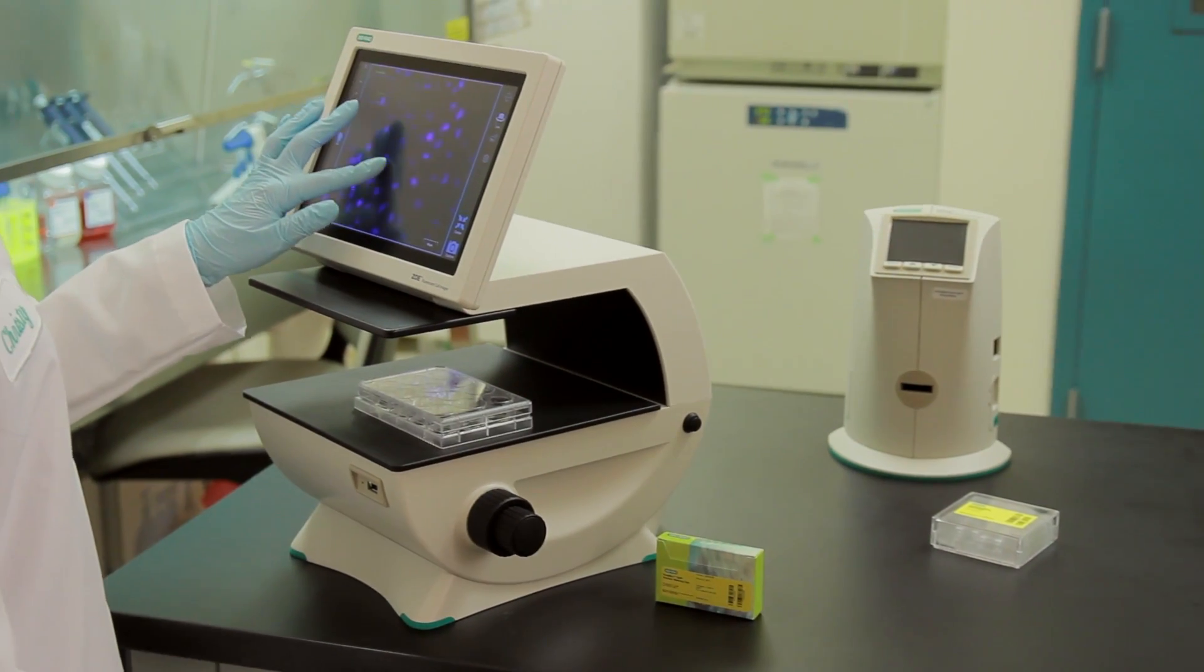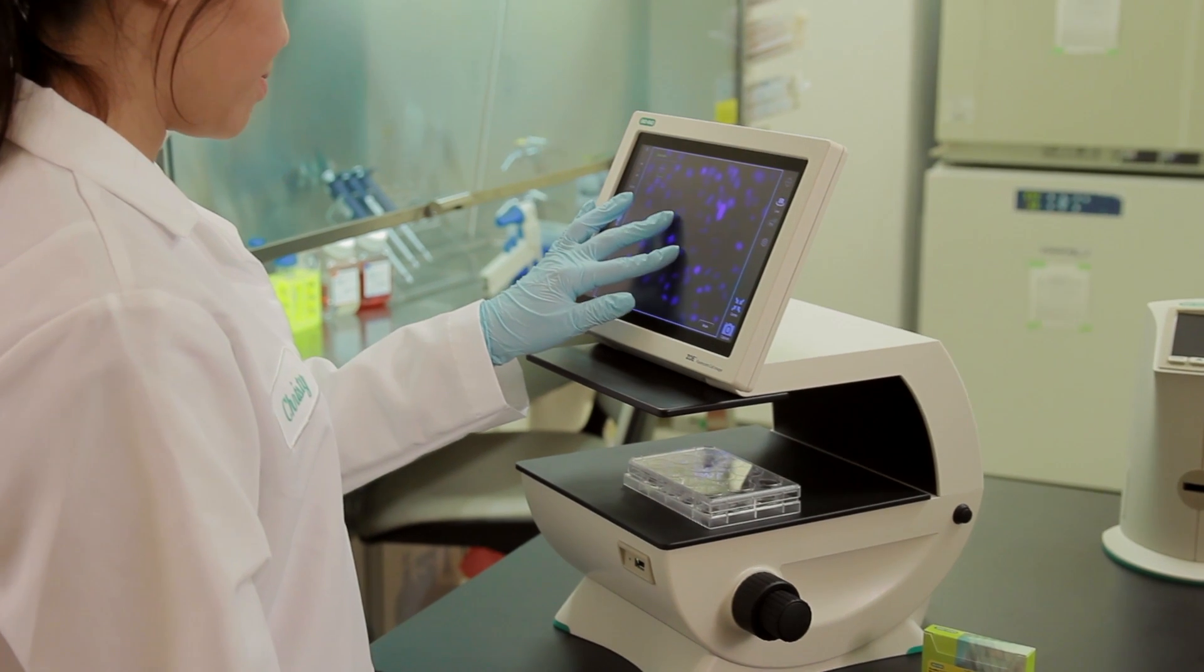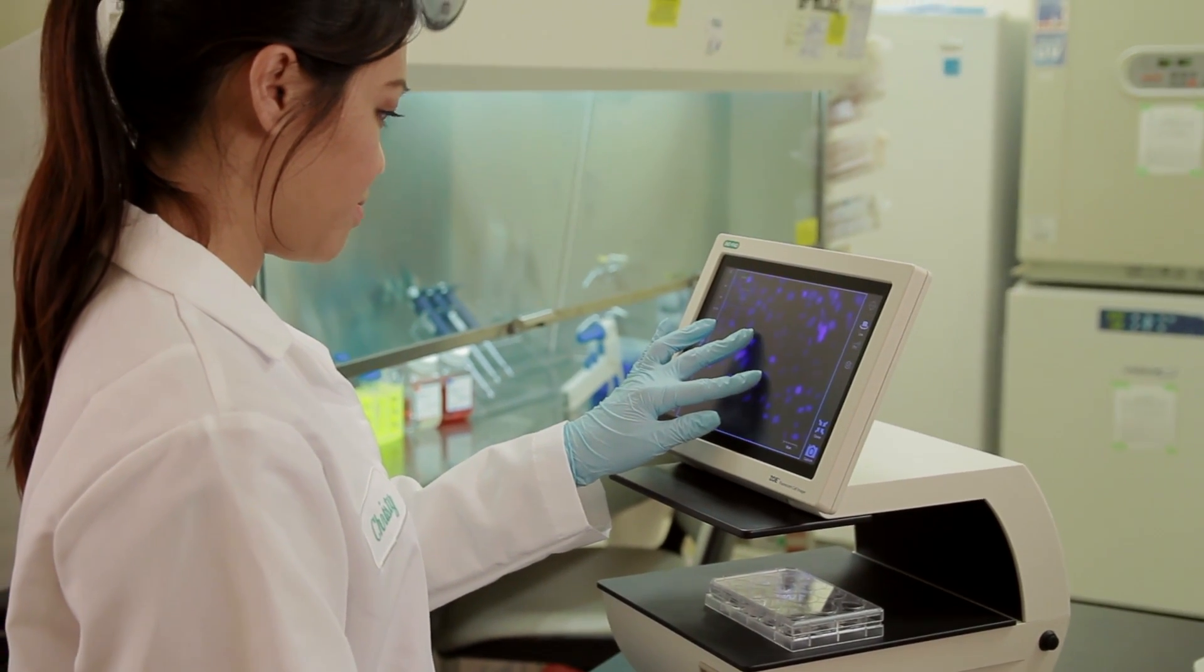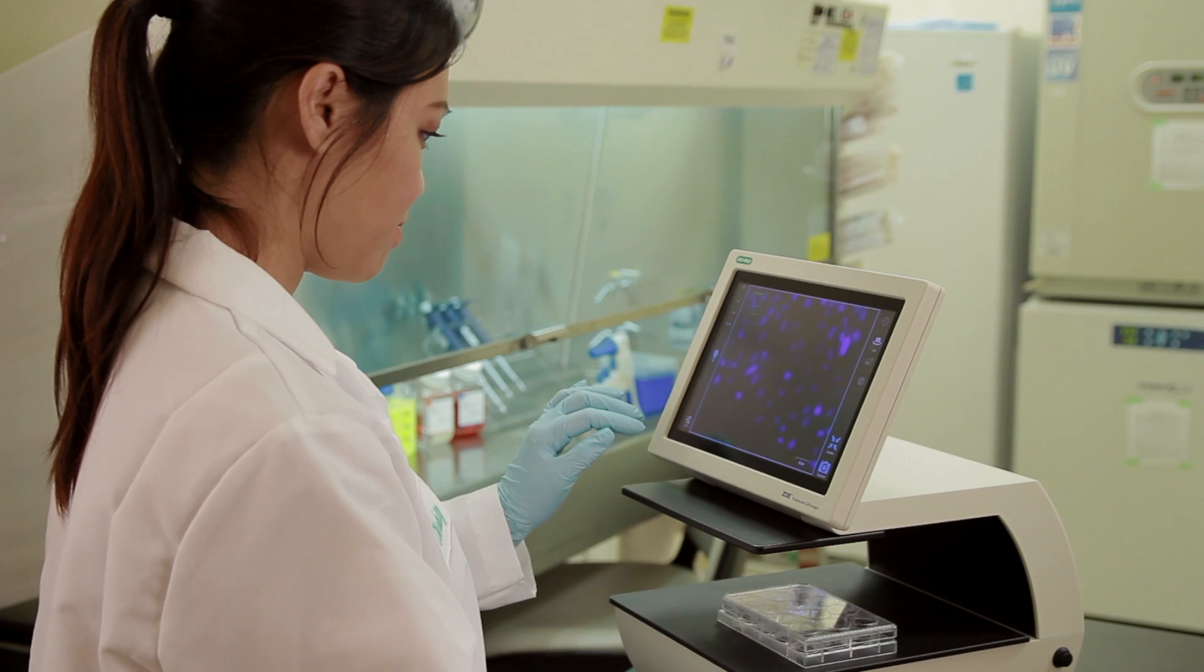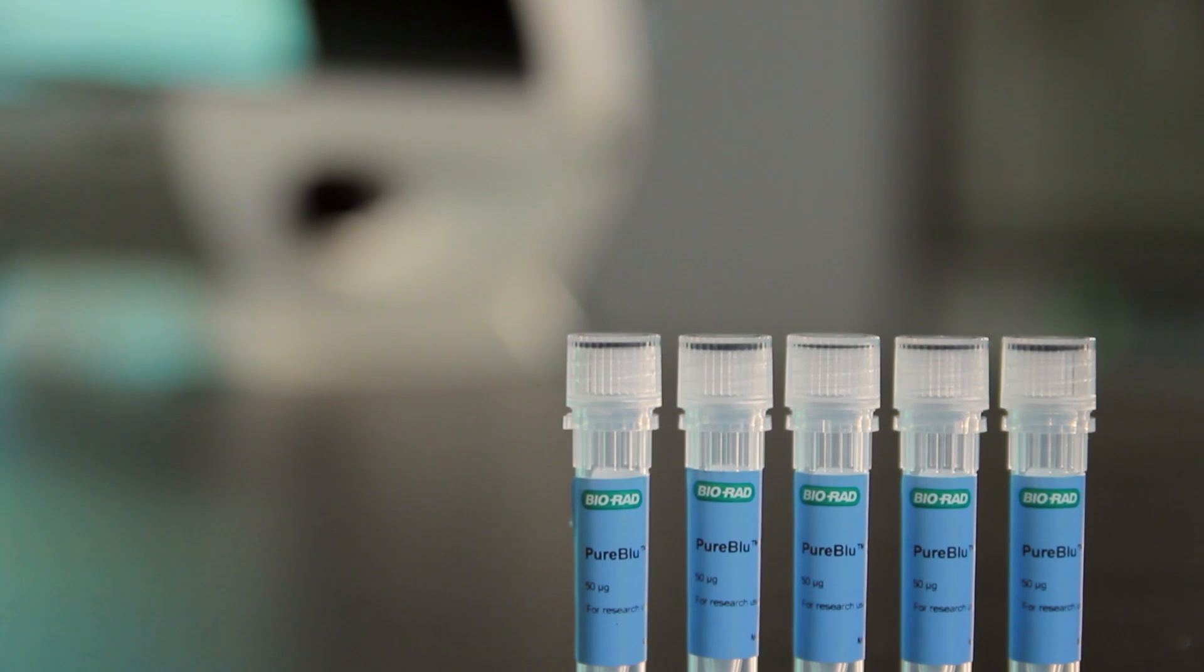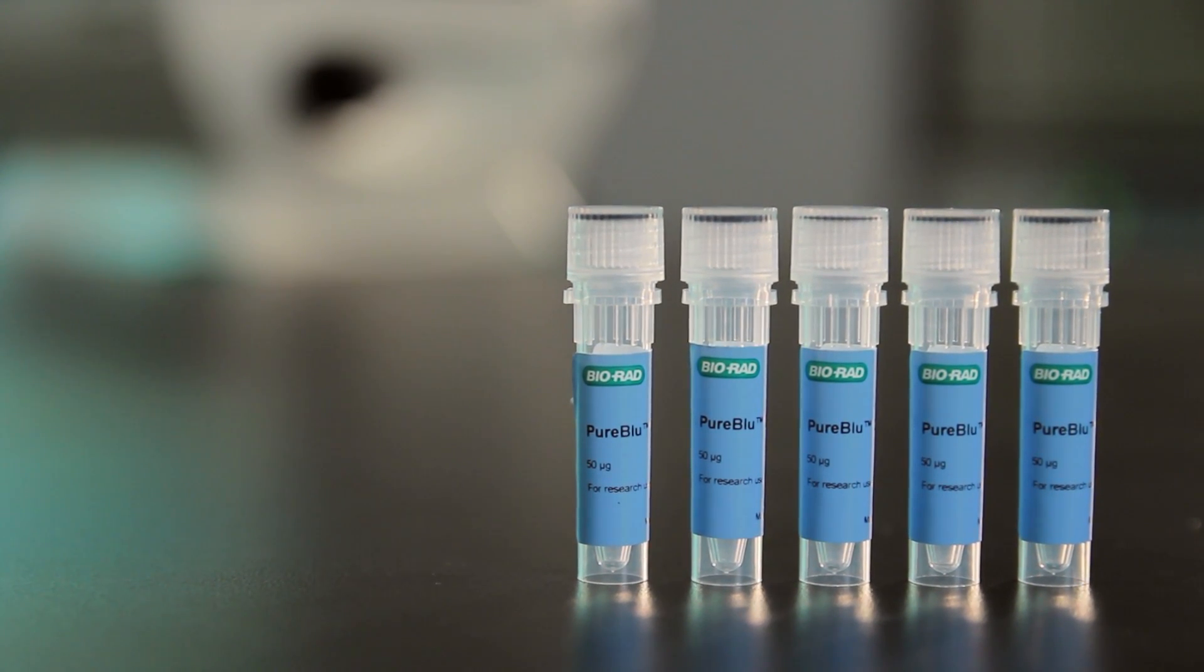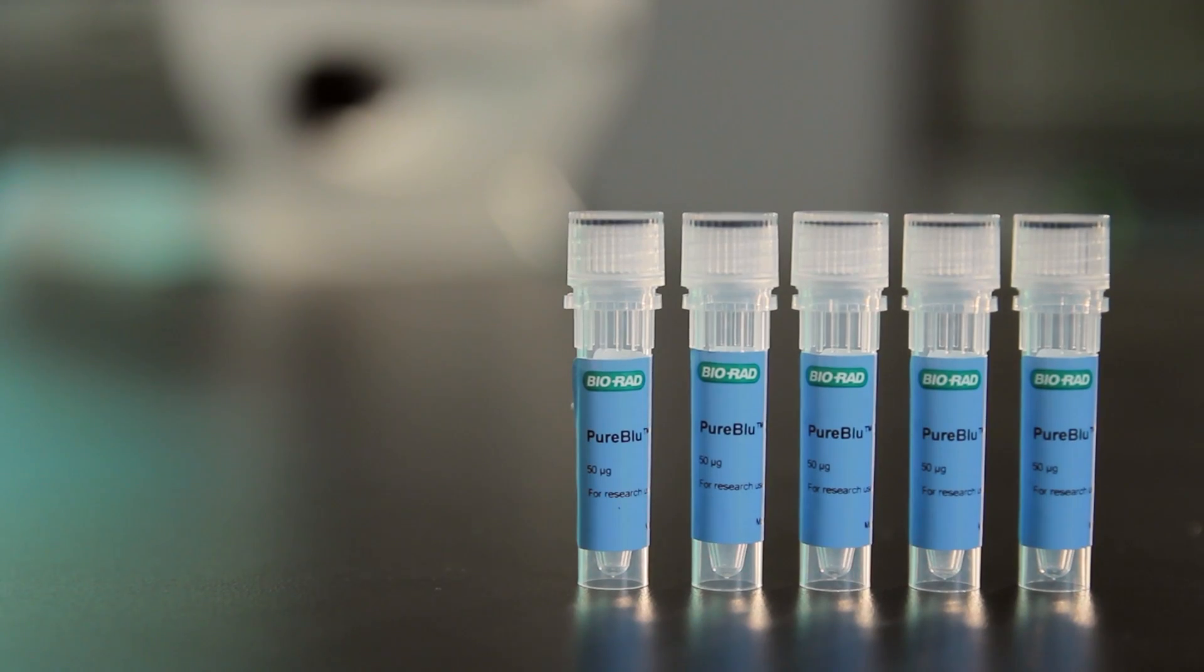Pure Blue DAPI can be used with any cell imaging systems containing a UV excitation source and a blue filter, such as Bio-Rad's new ZOE cell imaging system. Pure Blue DAPI is packaged in easy-to-use vials that can be diluted to the typical working concentration of 1 microgram per ml in a single step.